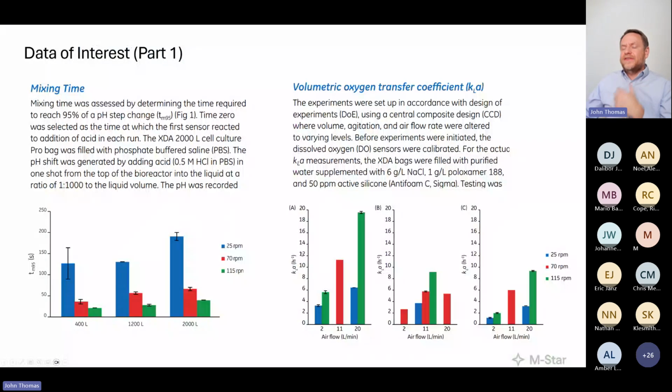And so there's a very nice set of data we can use to compare against. And the key point is this: there should be one model that can appropriately capture all these physics across the range of operating conditions correctly with no reparameterization. And where this really starts to flex is down here in the KLA.